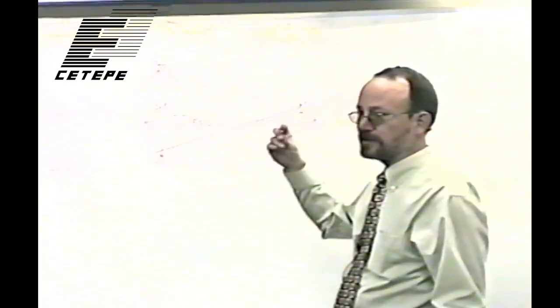But there's even, in the clinic, there's even bigger ones that go up to, I think, 38 centimeters is the biggest one. So the biggest one I've ever seen was about this big. And they're very expensive, those large ones. They cost about over $60,000. Ours, which is this size, costs about $35,000.